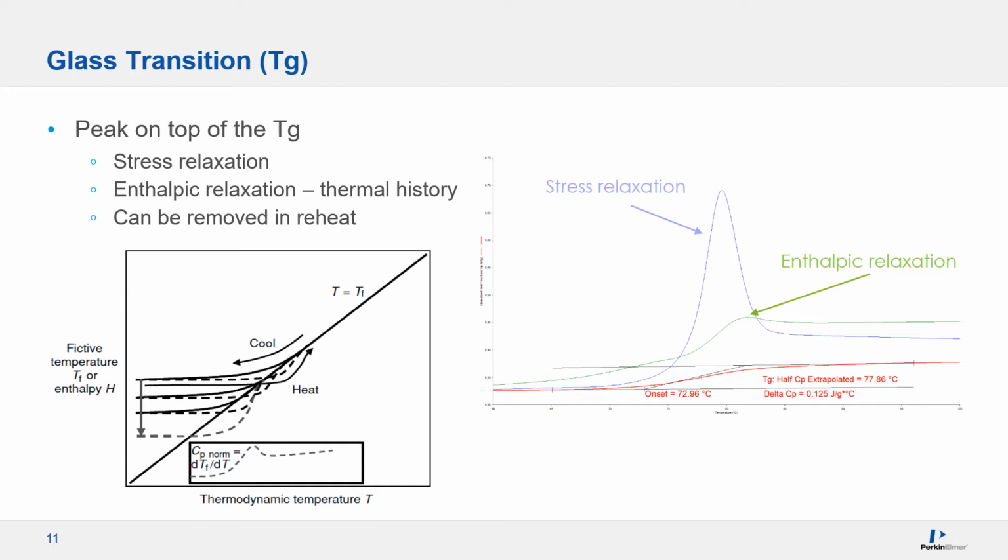Isothermally annealed just below TG, a material can relax into a lower energy state, as indicated. Heating annealed material at normal heating rate is likely to produce a slight overshoot of the true TG onset. Like the stress relaxation, enthalpy relaxation can also be removed using a heat-cool-reheat method.